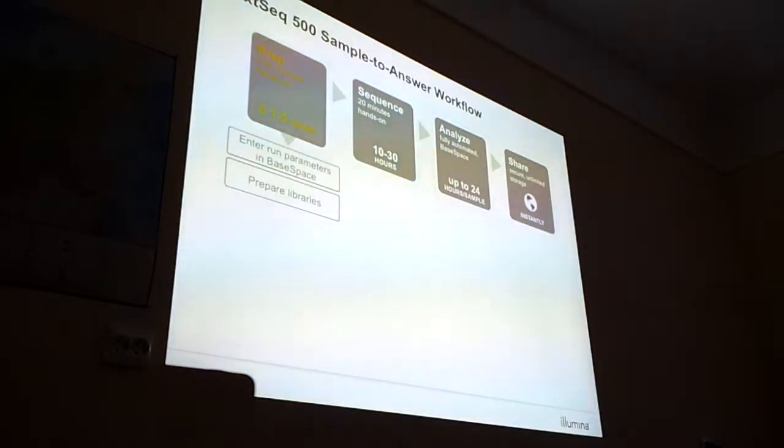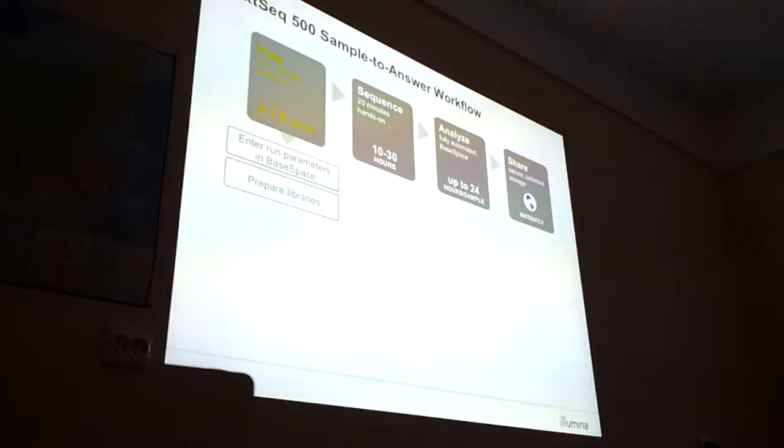So I will start with the prep step. So basically, you enter the run parameters, how you want to organize your experiment, and you prepare the libraries.